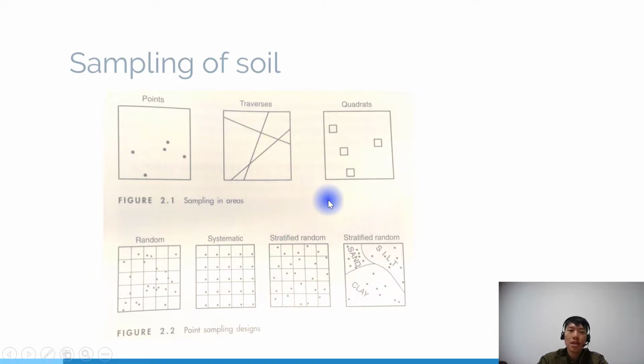So we do sampling outdoors, and in the case of soil, we need to visit the field, and you have seen the video by myself and a colleague. Now, let's say we have identified a field that's safe, on the campus or outside, and you get permissions. Then there are three main kinds of sampling in general. One is point sampling. We just drop randomly, throw a coin. Oh, these are the 3, 5, 6 point sites where we dig the soil and collect.